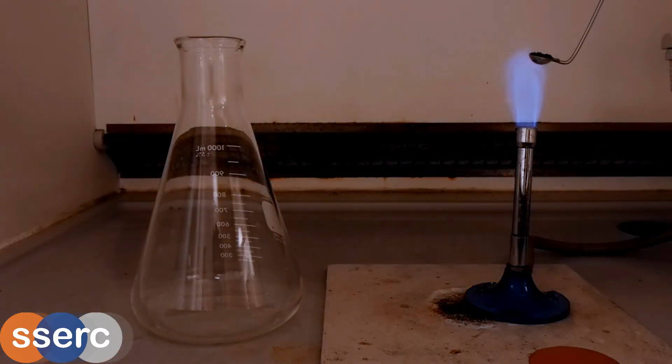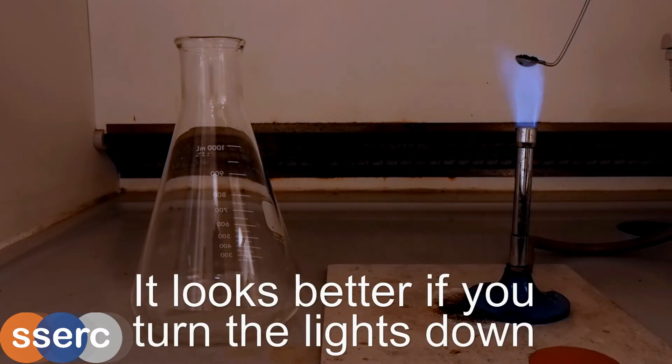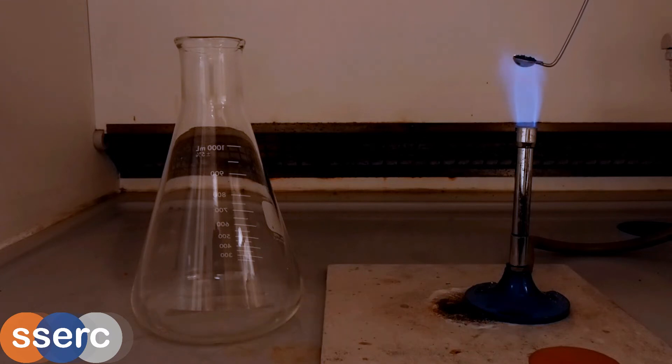Then take a deflagrating spoon of the chromium oxide and heat it strongly on a Bunsen burner. Once it's hot, you'll see the spoon glowing red and some sparking on the oxide. Pour it into the flask of ammonia vapor.